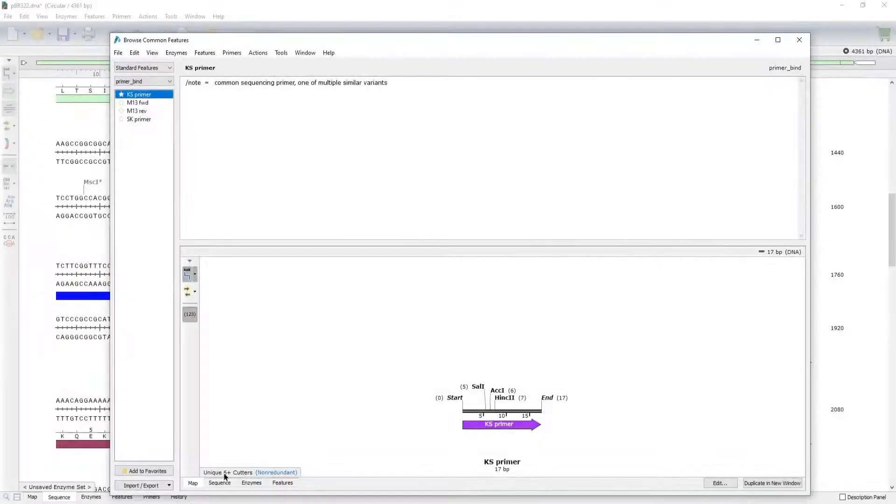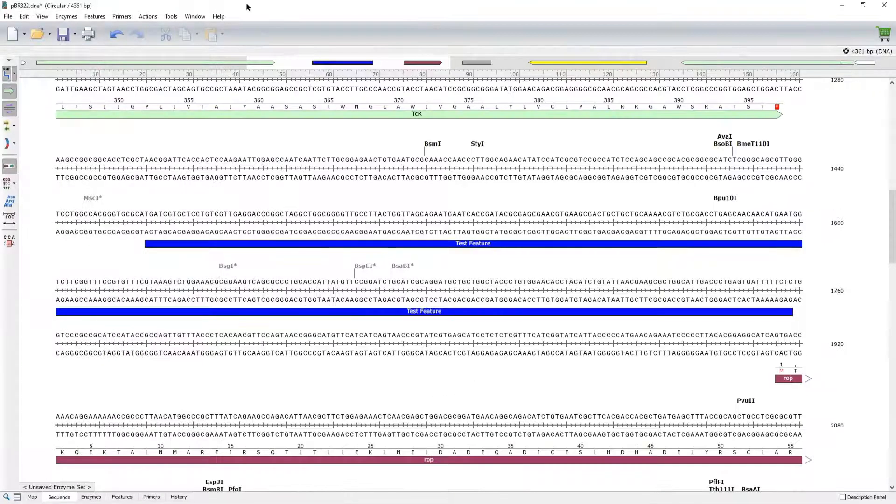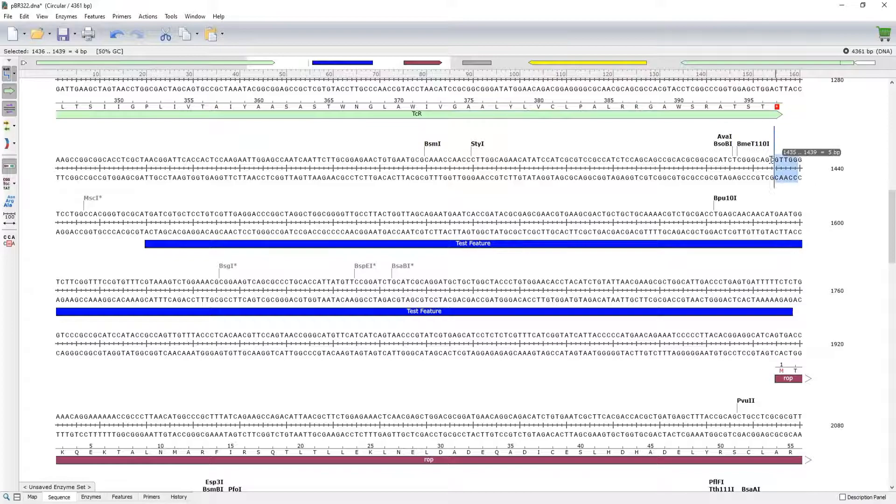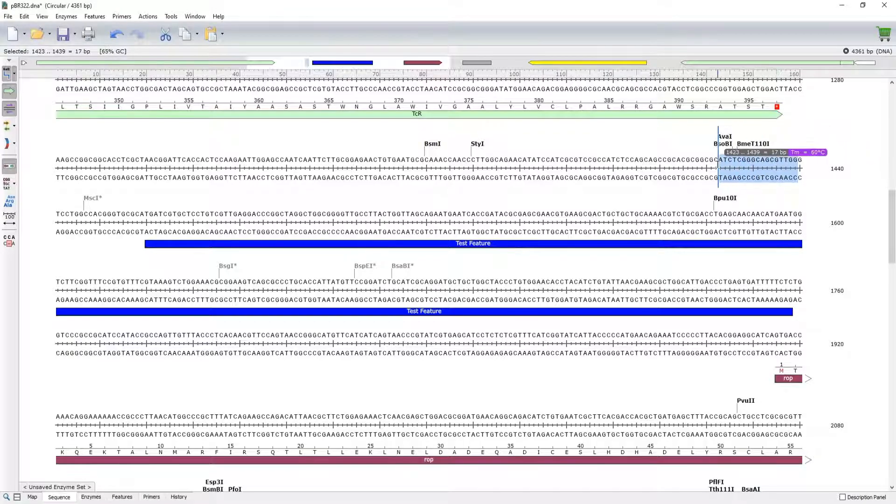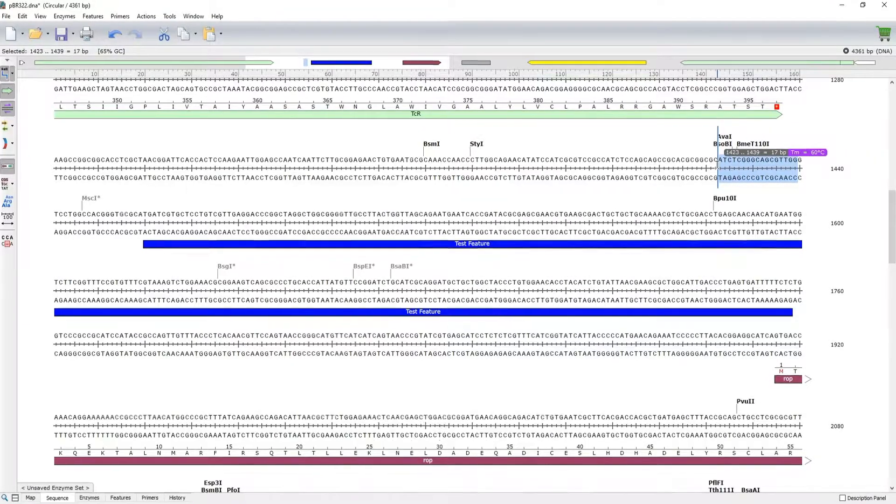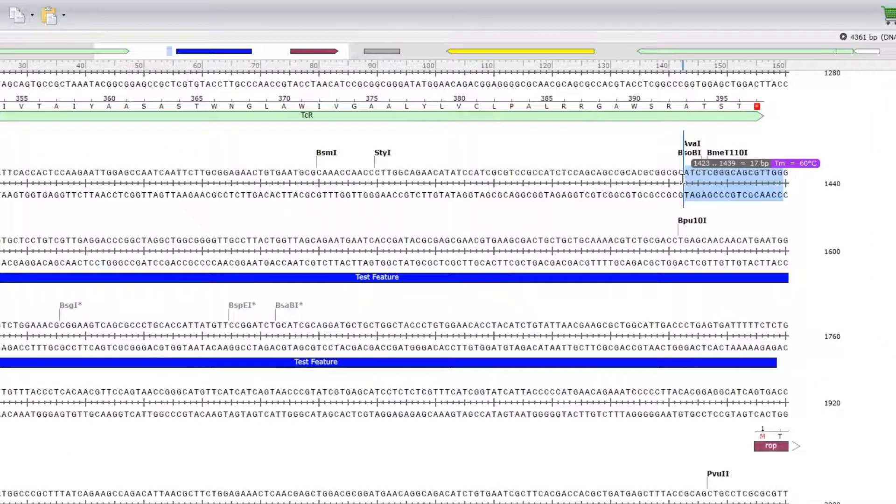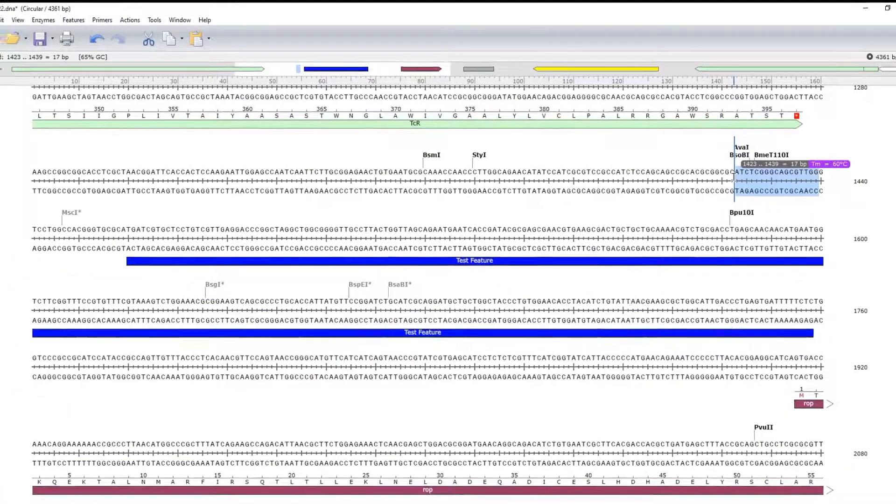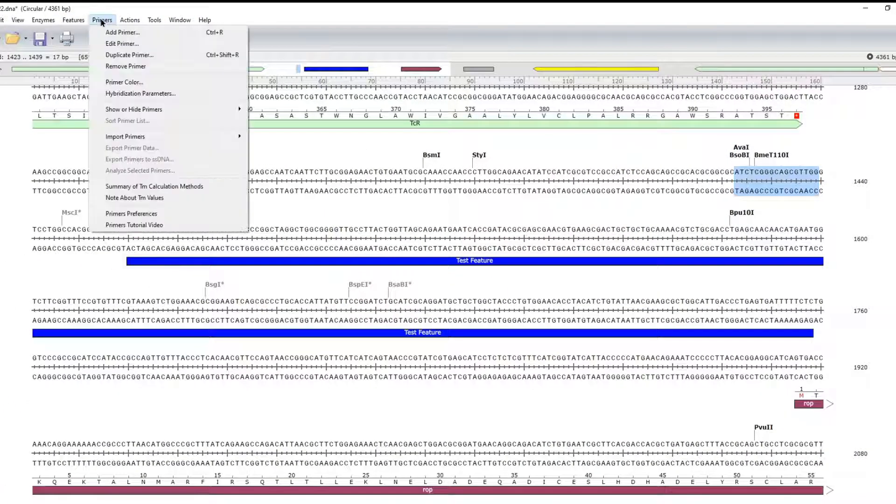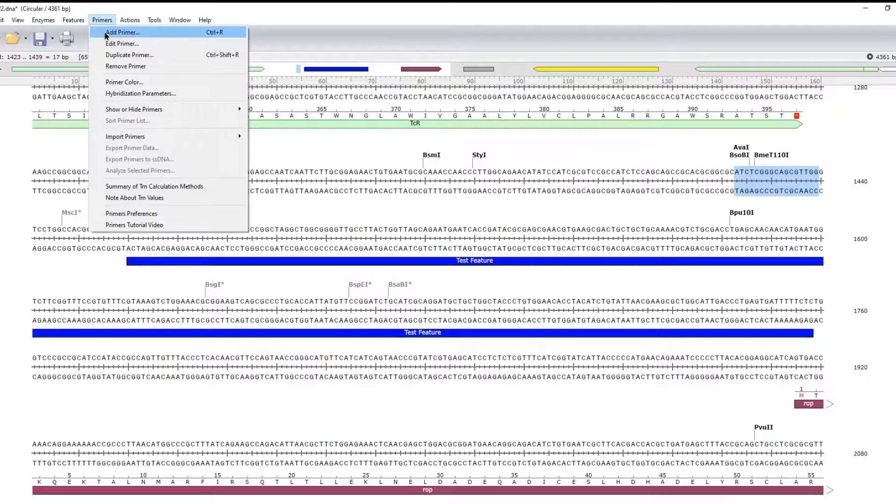You can create new primers via the sequence view. Click and drag to select your DNA sequence. It's easy to save your selection as a new primer via the Primer menu window.